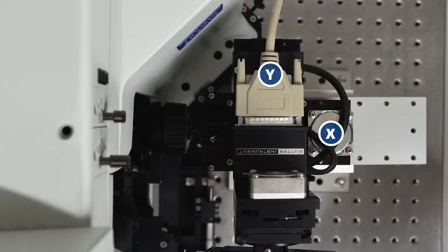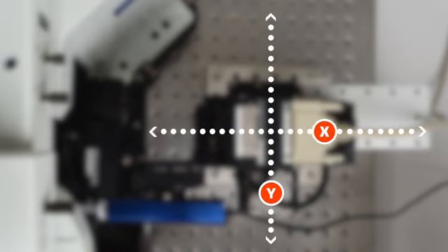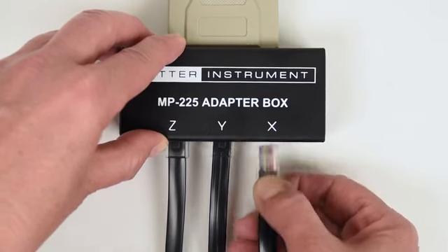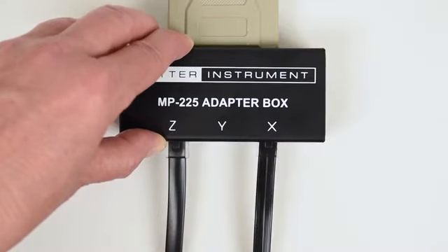By installing the right angle adapter, we have turned the manipulator 90 degrees. The x-axis now behaves like the y-axis, moving forward to back, and the y-axis behaves like the x, moving from side to side. We can correct this by making a simple change to the controller. On the MP-225, turn off the main controller. You can simply reverse the X and Y RJ45 plugs on the cable adapter box between the controller and manipulator.